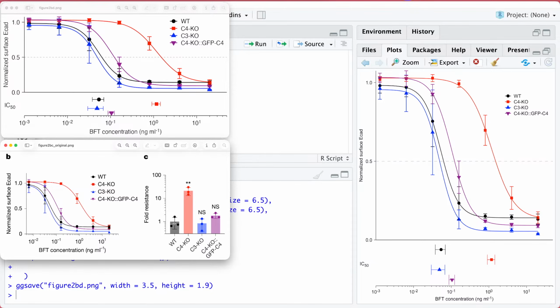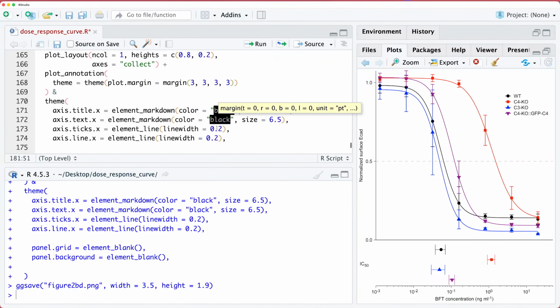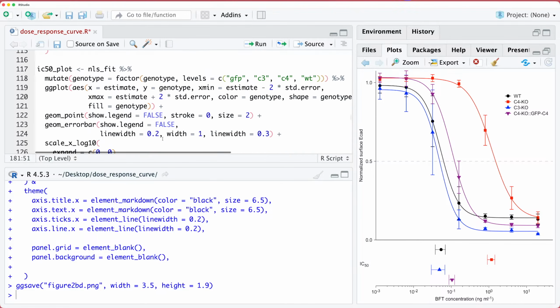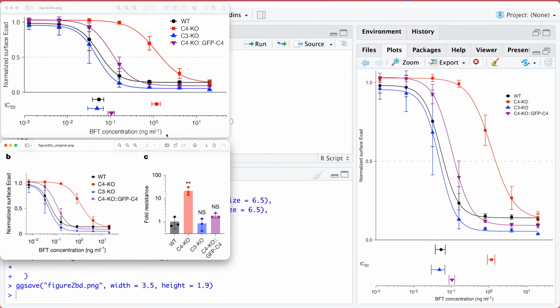I have 2 line width values for geom_errorbar. Do I? Geom_errorbar. I do. Good eye. And I think it's supposed to be 0.3. That's cool. Thank you. Good eye.